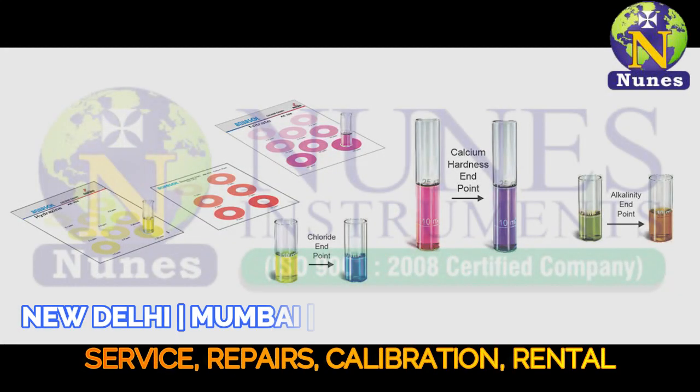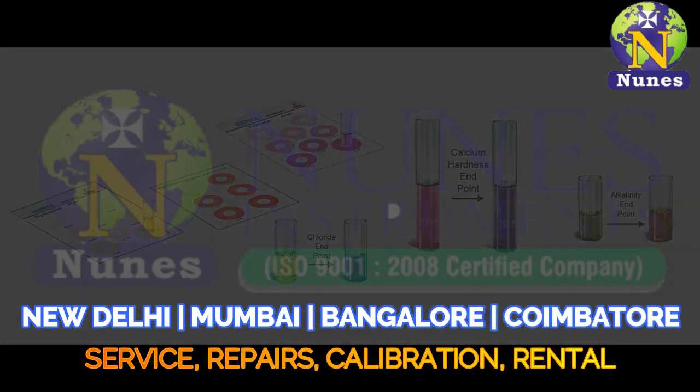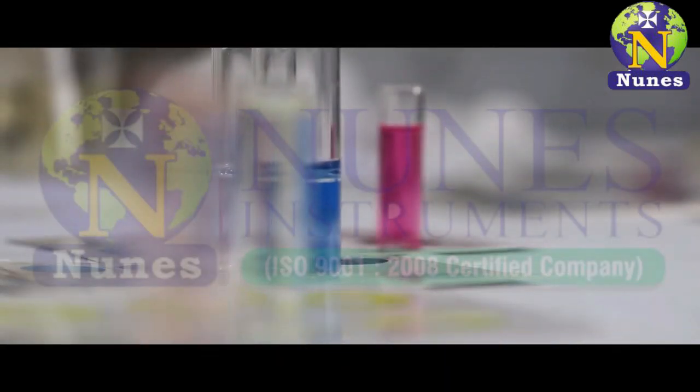We have similar testing procedures for silica, phosphate, copper, etc.